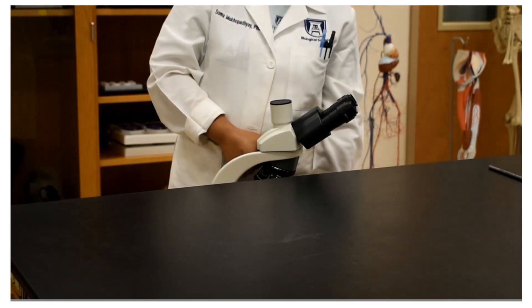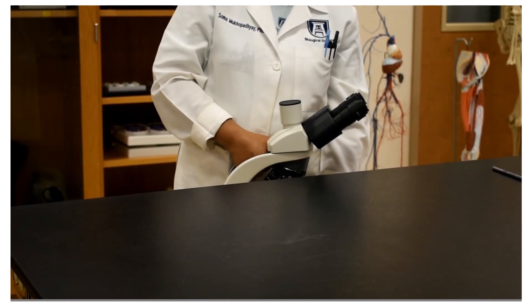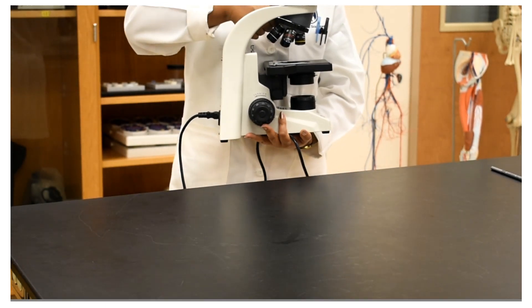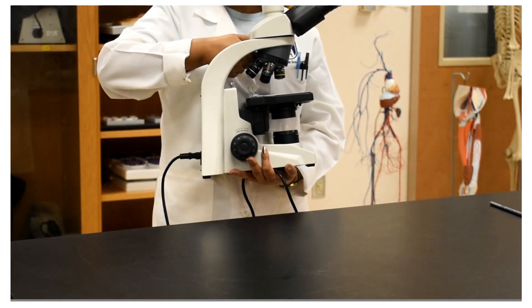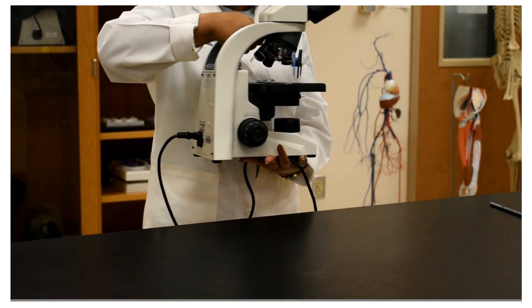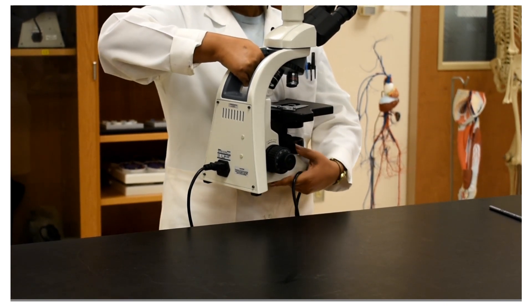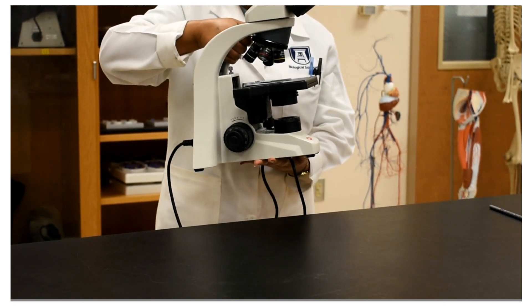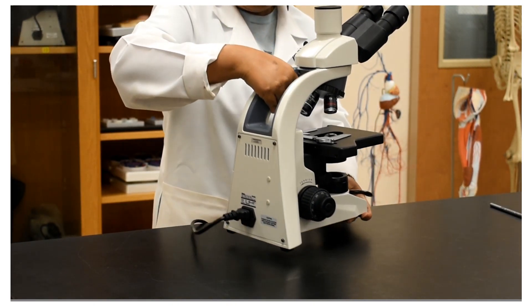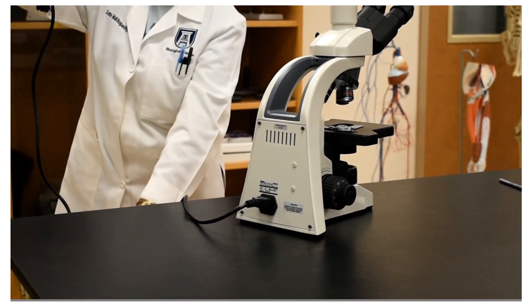The very first thing about handling the microscope — whether we are taking it out from the cabinet or putting it back — never ever hold a microscope with one hand. Always support the base, and at the back there is the arm. Hold the arm with one hand and give support to the base, then take the microscope out and put it on the table.